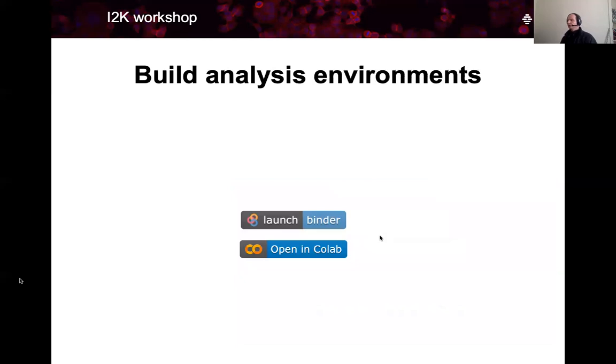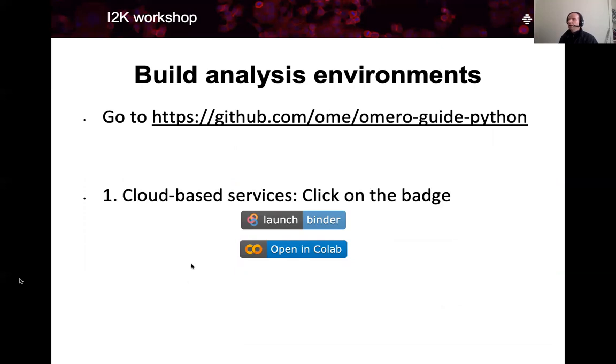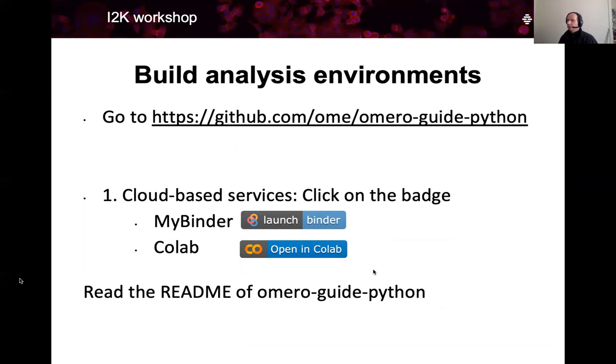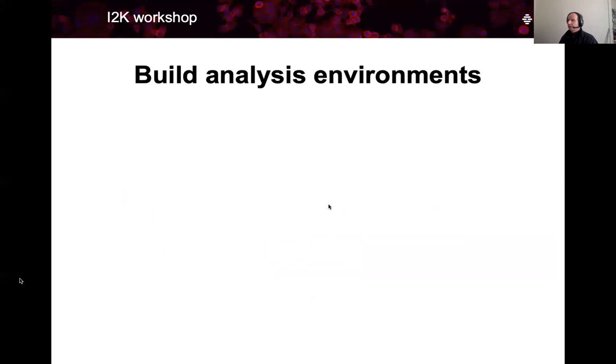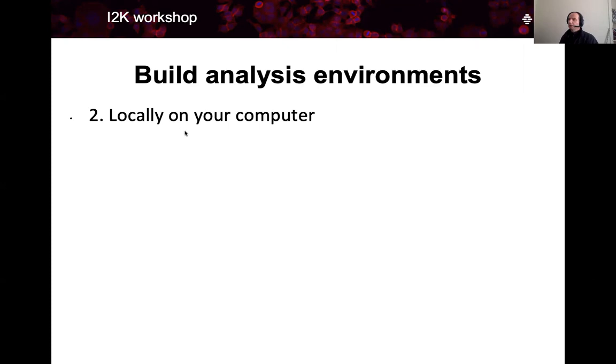So how to build this Python environment? Well, first of all, you can simply go to omeroguide.python on this URL. The URL is also underneath this video and click on the badge. This will immediately spin up the environment for you and you don't have to worry about anything. If you are a little bit command line shy, you might be happy with the cloud-built environment and ignore what I'm showing right now. And this is how to build the environment locally on your computer.